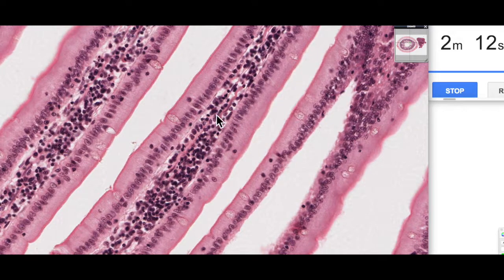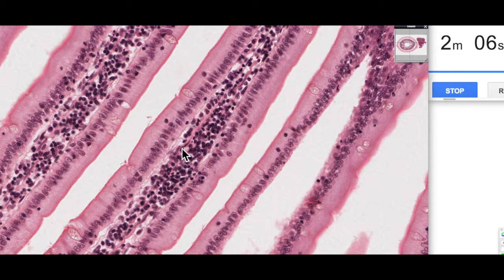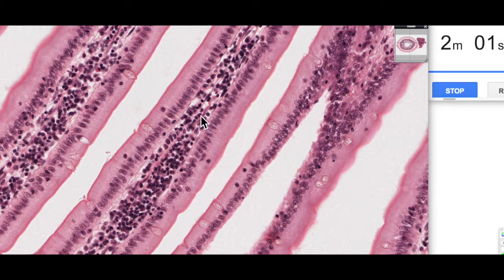But we can begin our interpretation of some of these other cells as well. So you can see these elongated cells here. They've got the elongated nuclei and then they've got these very acidophilic cytoplasms running away. These are actually smooth muscle cells and that helps you to identify them because of their acidophilic cytoplasms and their elongated nuclei.